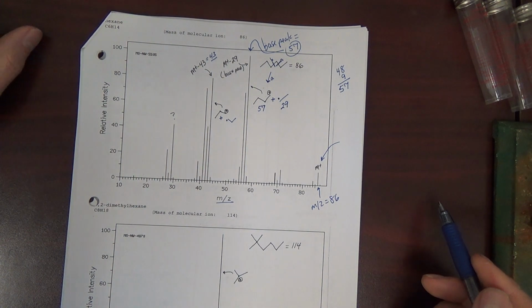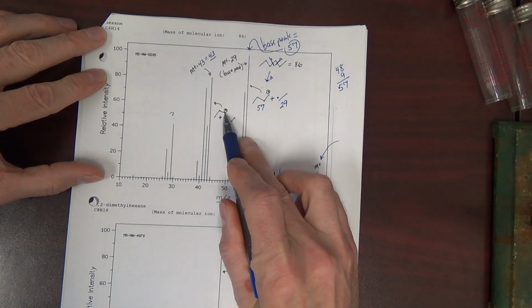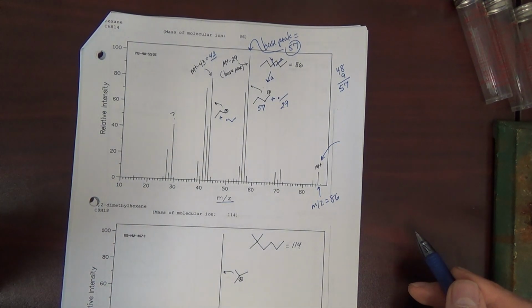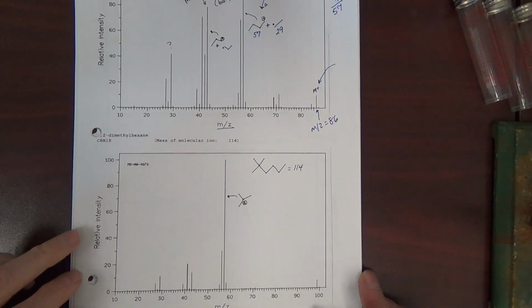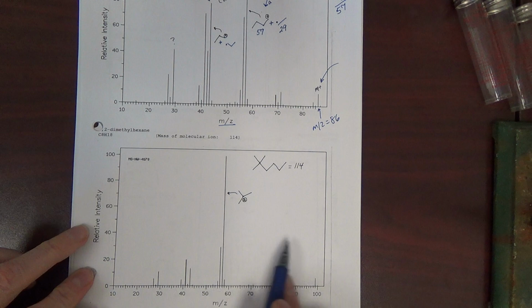What type of cations did we form here? We formed a primary cation and we formed a primary cation. Is there a better cation that we could have formed? The answer in this case is no. In the example below, we will see that we can form a better cation, and that the spectrum is kind of cleaner. It's more selective.